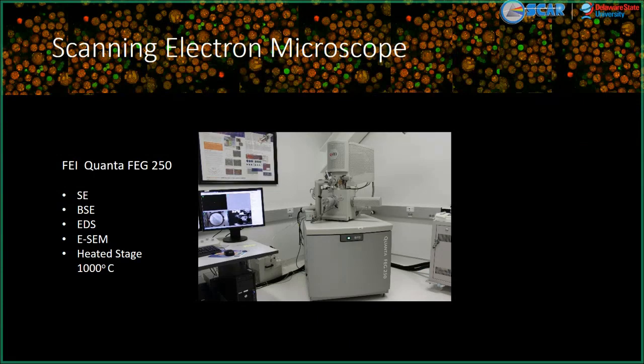And when we do this, we can get very high contrast, very high resolution images of untreated samples. This works wonderful with samples that are botanical, seeds, plants, mostly plants, insects, anything you can pull out of the environment. I've even taken pond samples and cooled them down, and I've taken images of these types of samples. Cells, a little harder to work with. Things like yeast and bacteria is possible, but there are very difficult techniques involved with doing that.